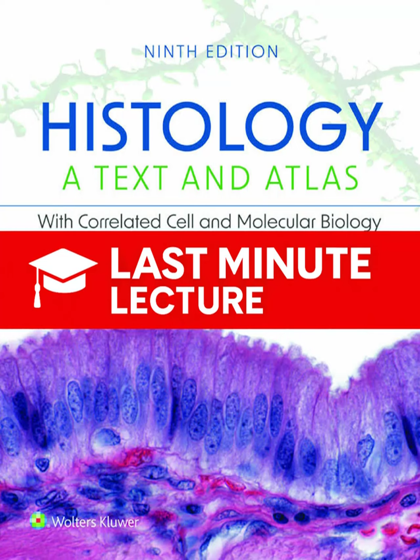You then make a platinum and carbon replica of that exposed surface, dissolve away the actual tissue, and look at the replica in the TEM. It's the only way to really see the integral membrane proteins embedded within the membrane structure. Okay, then there's the Scanning Electron Microscope, or SEM, which works on a completely different principle and gives us that famous 3D surface view. That's right.